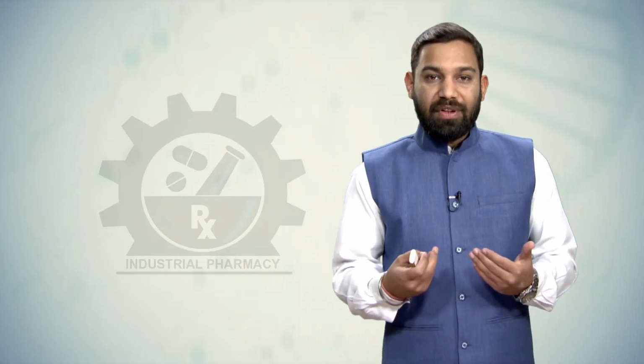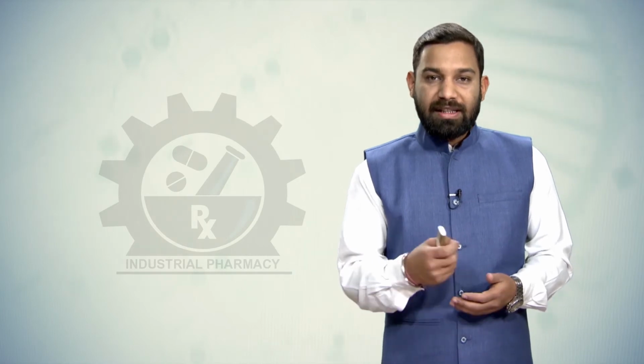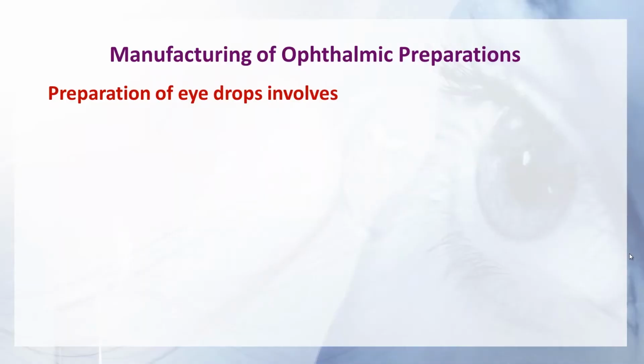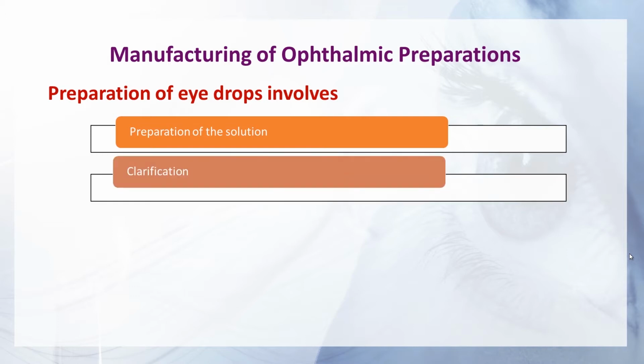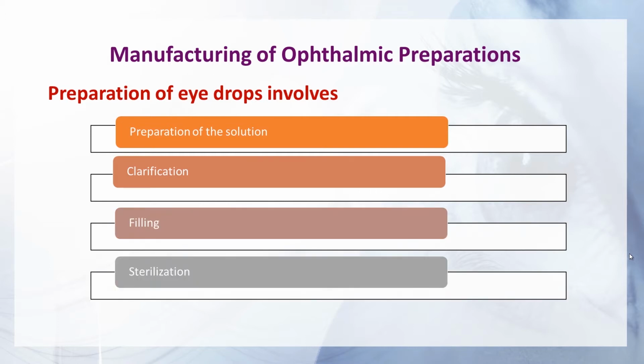Now, starting with the manufacturing of ophthalmic preparations. In this category, I would like to discuss first the eye drops. The preparation of eye drops involves the preparation of the solution as the first step, clarification as the second step, filling, and then followed by sterilization.